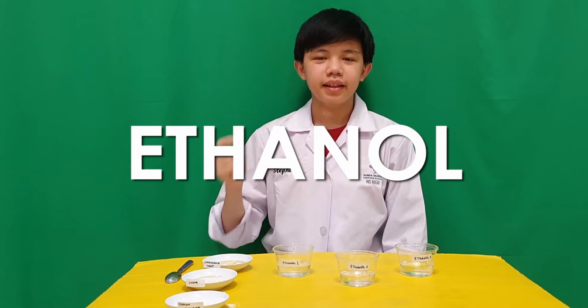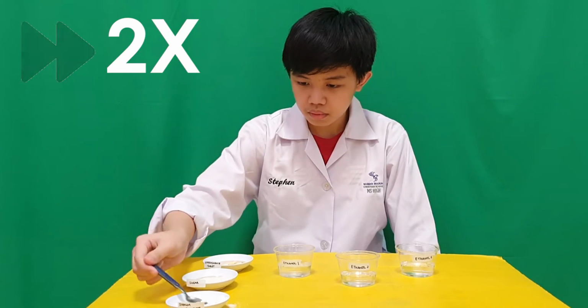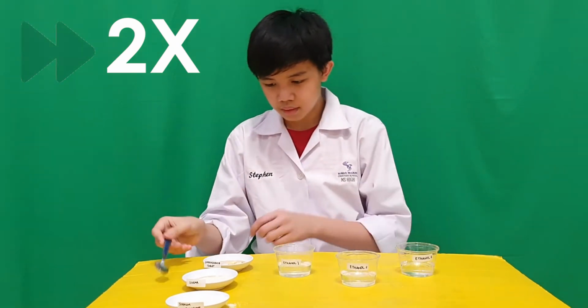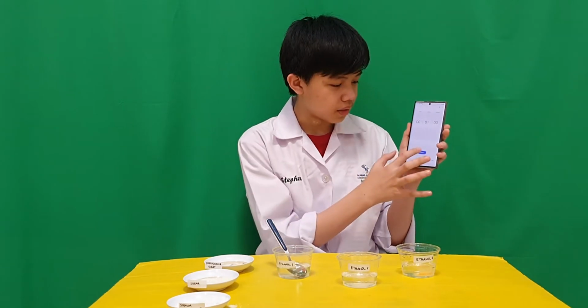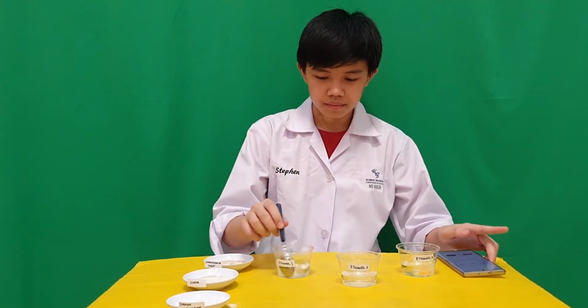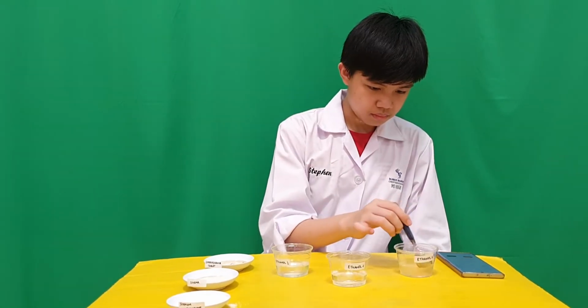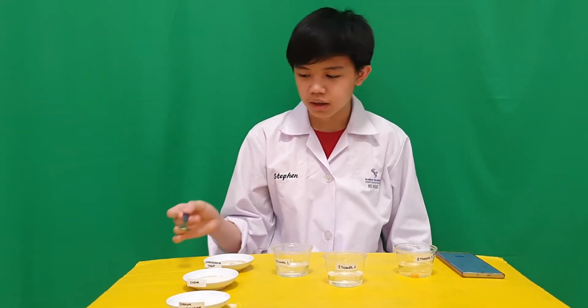How about we try using ethanol? Let's do the same experiment using the ethanol substance. Let's go. One minute starts from now. Okay, so here are the solutions.